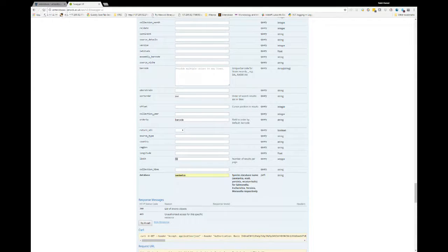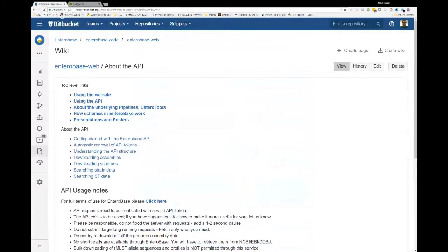Any other questions from people? Here we go. Can we use the time tag to sync the sequence files of loci? All right, I might need more clarification, so expand on that question if I don't quite get it.